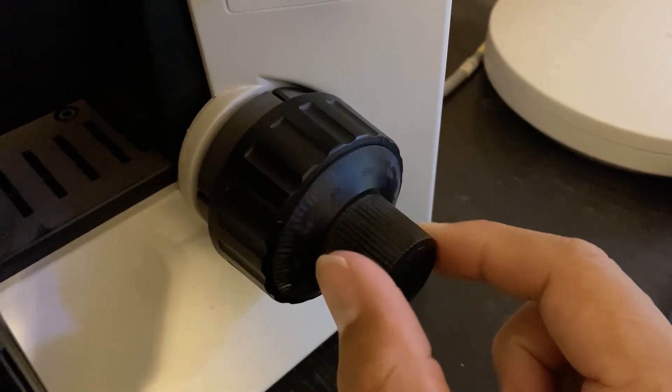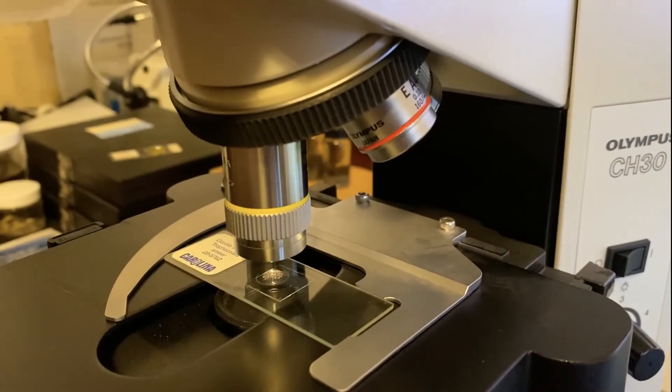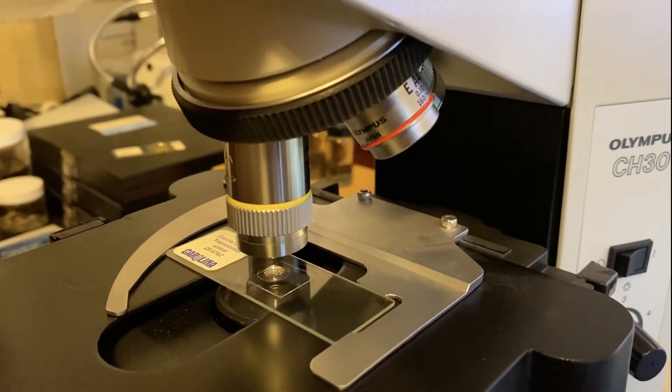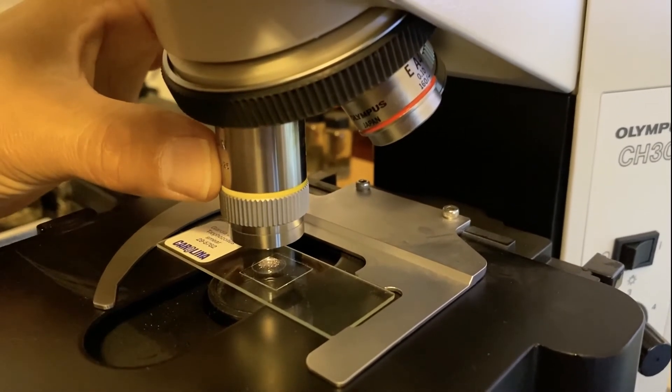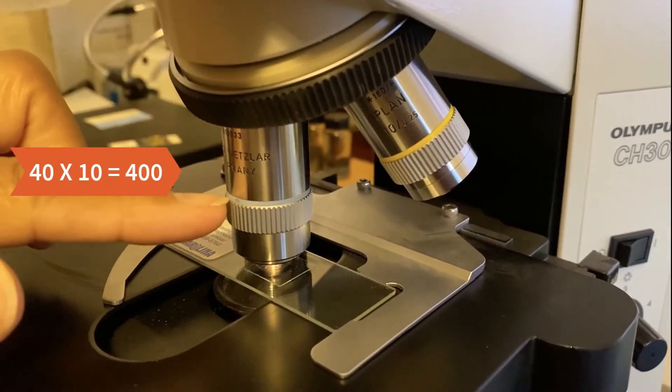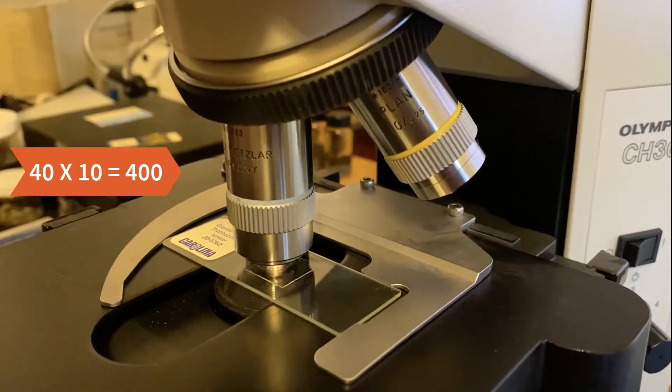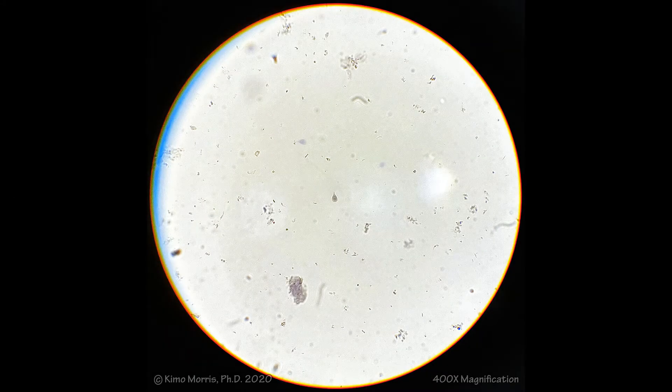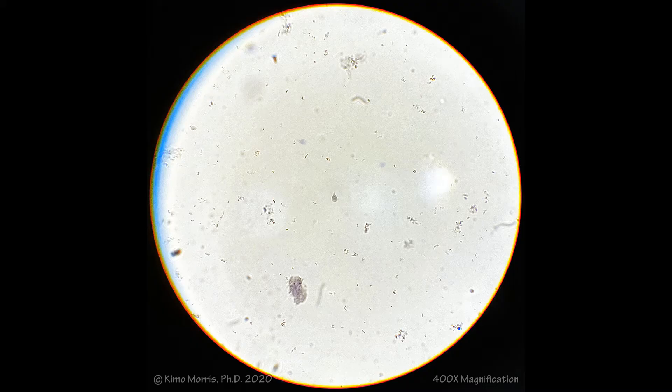So at this point, you want to use your fine focus to just make sure that you're focused in on the proper plane. So if it's slightly blurry, you would be using your fine focus here. And from this point on, you're only going to use your fine focus. Now I'm going to switch to the next objective lens. This is a 40 times objective, so my total magnification is 400 times. Again, I'm using my fine focus just to make sure that I'm still in the proper plane, and I'm going to move my little critter right here into the very center of my frame.